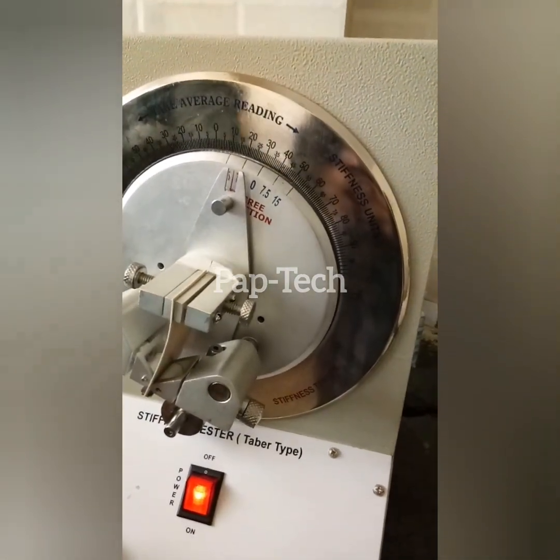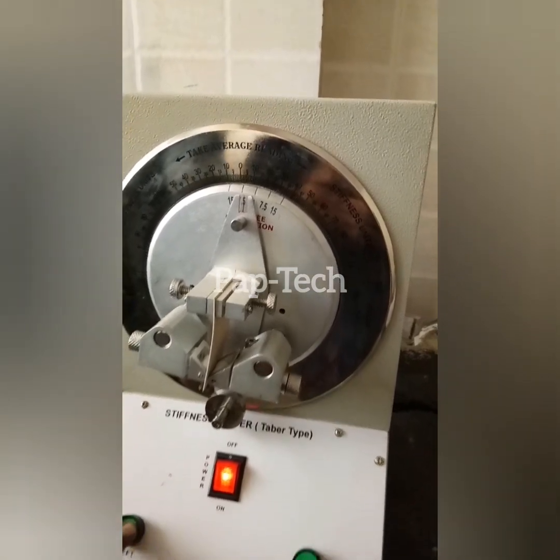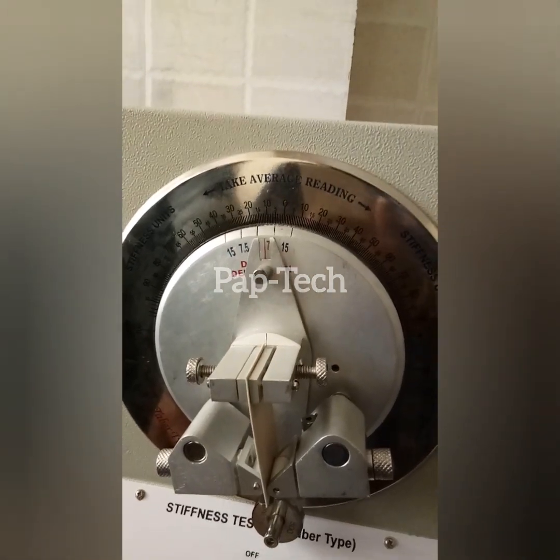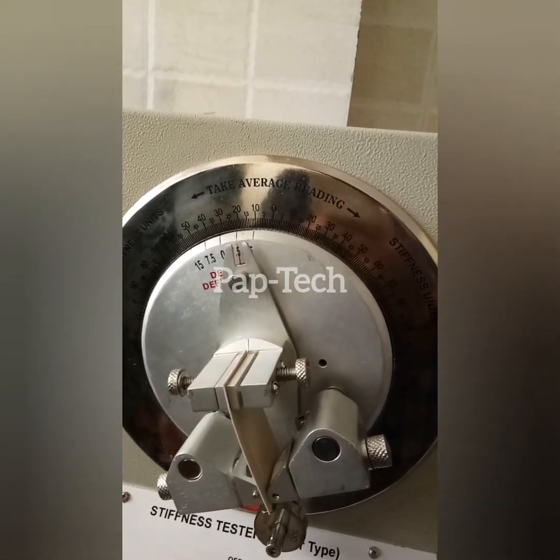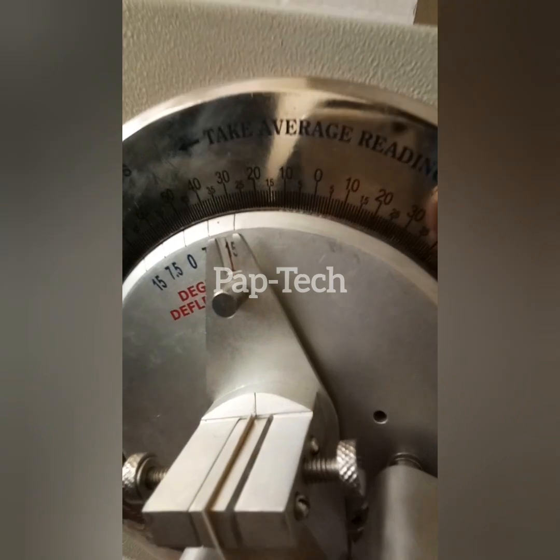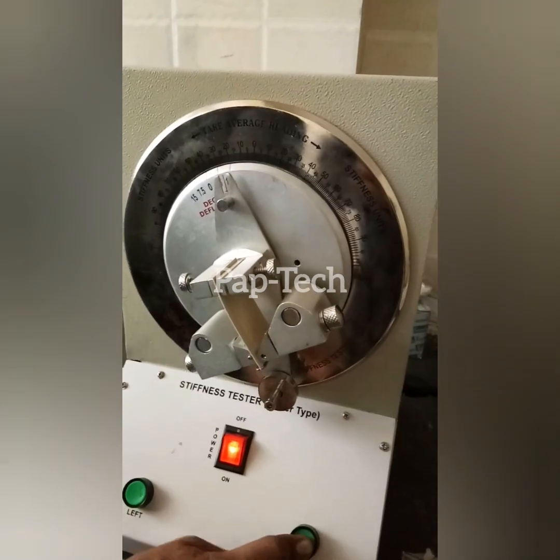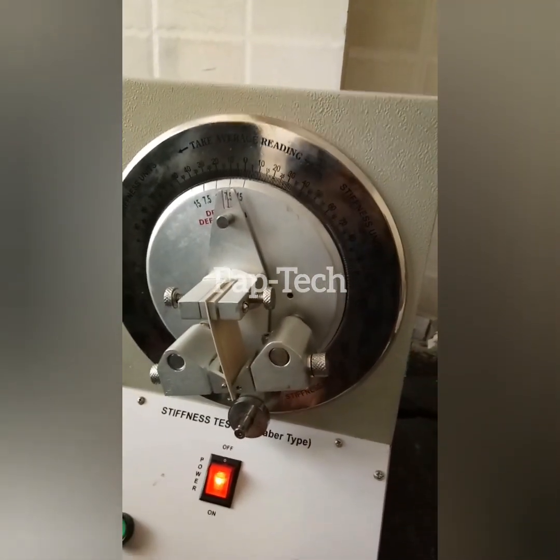Now we will take the reading on the left side at 15 degrees. The reading stops at 32. We will take the mean of both ratings: 32 plus 32 divided by 2, that is 32, and then multiply by 5, so we will get 162. Plus or minus 5 will be the accuracy for it.